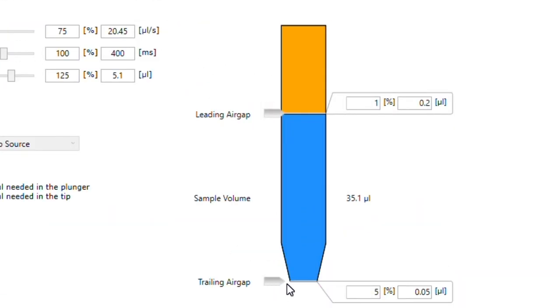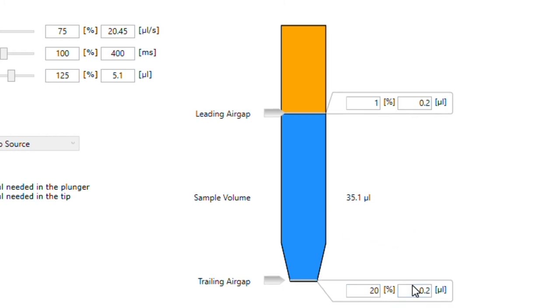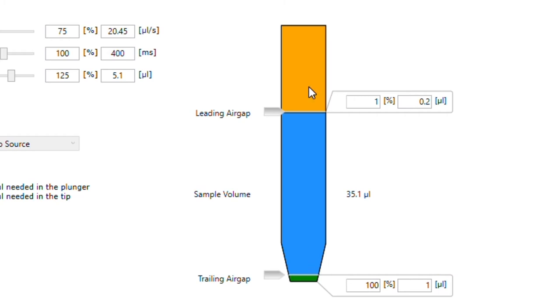You have your trailing air gap, your sample volume, and your leading air gap, and you can change these percentages. If you wanted to increase the trailing air gap, you can do that — you can do one microliter, whatever you want. The reason you'd want a trailing air gap is to prevent drips. If your sample is very drippy, you want more air there to prevent dripping. A leading air gap is for blowouts — if you still have a lot of liquid retained, that's where you want to increase the leading air gap.